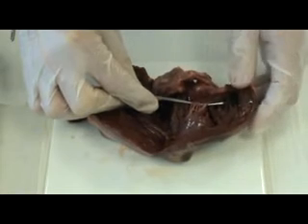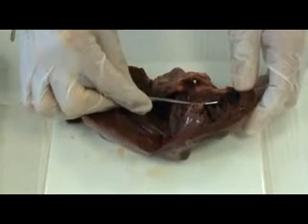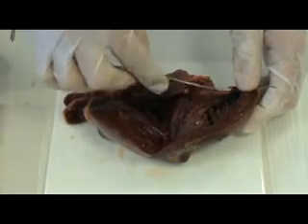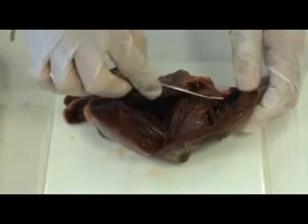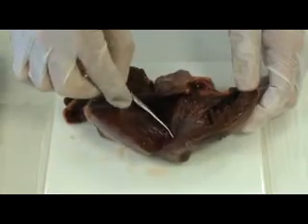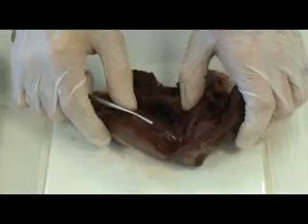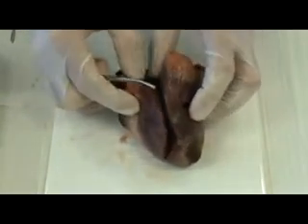Those tough fibers that hold the bicuspid valve in place. The left atrium is again pumping blood into the left ventricle, which then has the job of pumping blood to the rest of the body.